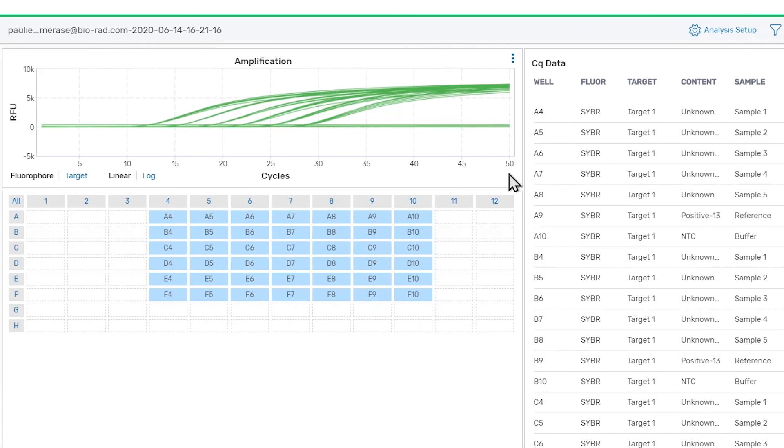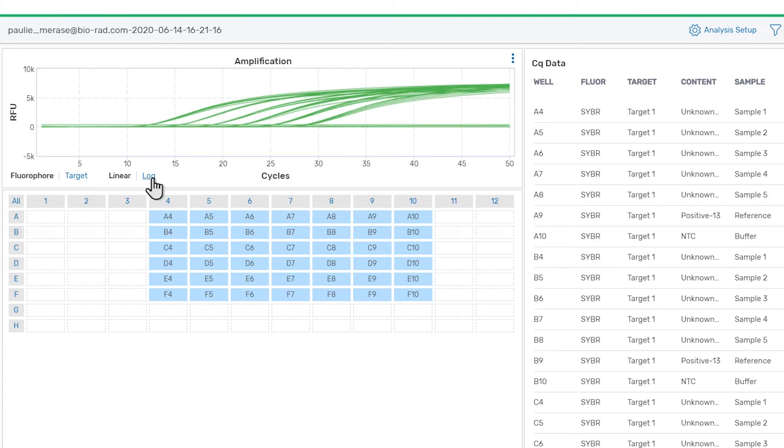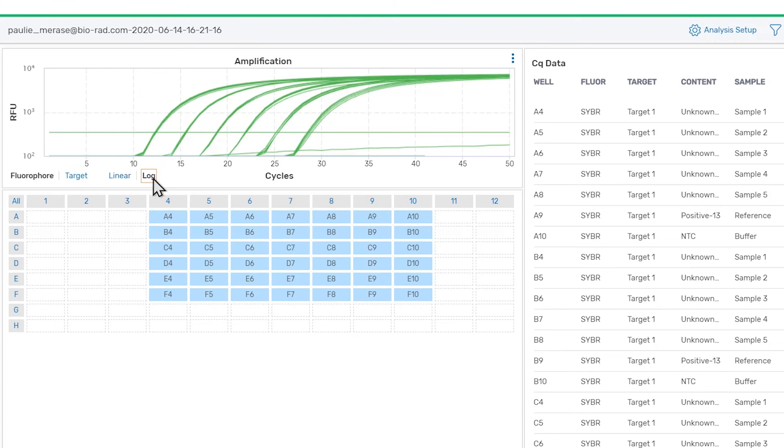Below the toolbar is the amplification chart, which displays traces of the fluorescent data collected during the run. The RFU data are displayed using a linear scale by default, but you can click the log button to use logarithmic scaling instead. The data are also color coded according to the color assignments found on the plate setup page.